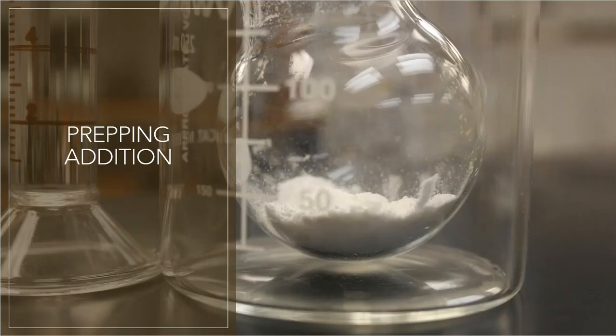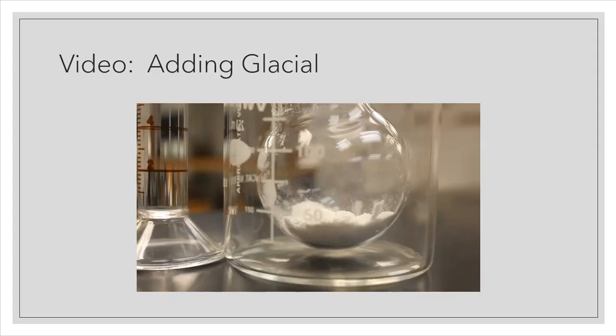Then I'm going to take my transcinnamic acid, and here's what it looks like in the boiling flask. You can make observations of that as well, starting reagents. That's something that we typically write down in a notebook. And then I'm going to take those two things, and I'm going to mix them. And here's a video that shows you what happens live when I do mix those two components.